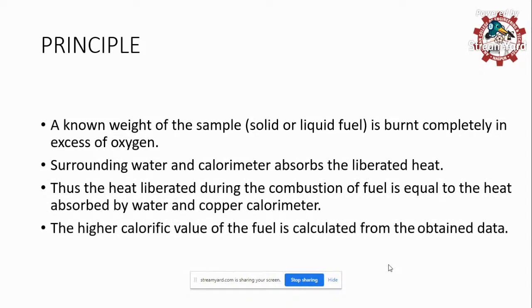The liberated heat during the combustion of the fuel will be equal to the heat transferred to, or absorbed by, the water in the copper calorimeter. So the higher calorific value of the fuel is calculated from the obtained data. This is nothing but the principle of the bomb calorimeter. I hope I am clear. Am I clear?